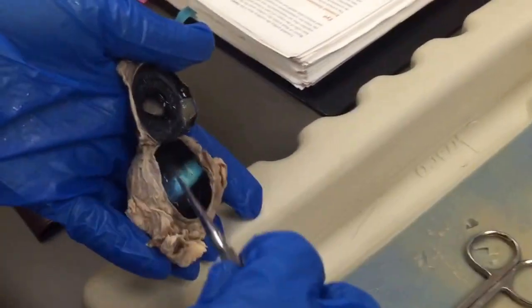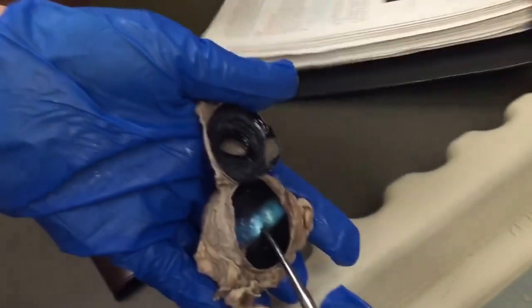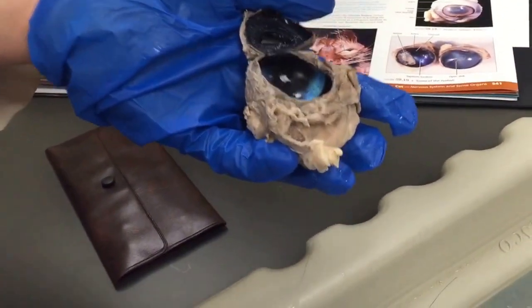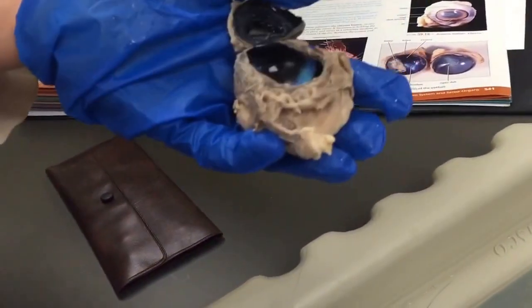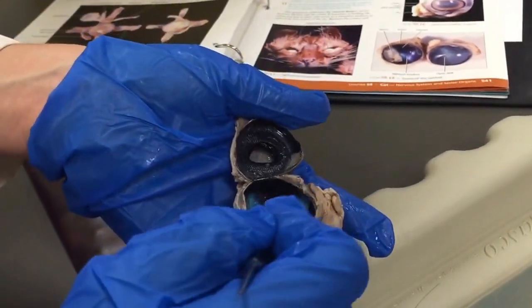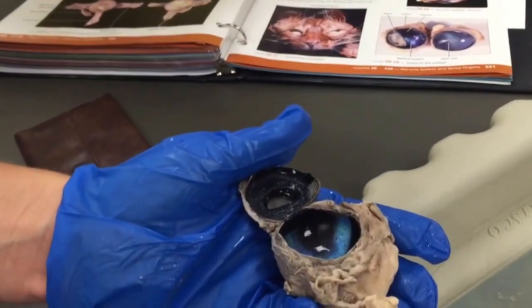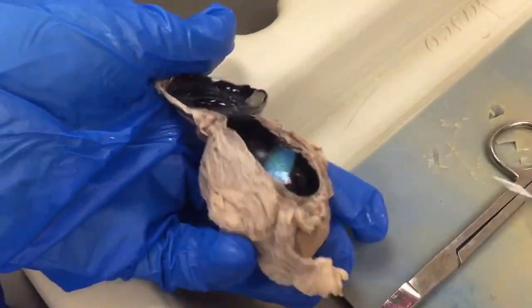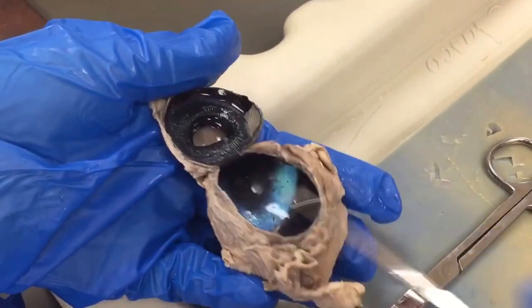Tapetum lucidum — this shiny, blue shiny part — not to be confused with the septum lucidum of the corpus callosum in the brain. This is the tapetum lucidum. And the choroid is the darker part back here, next to the tapetum lucidum.